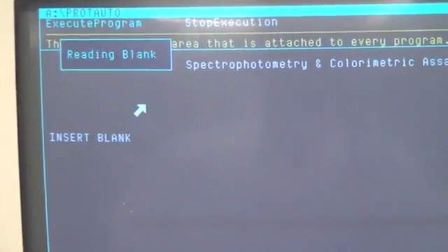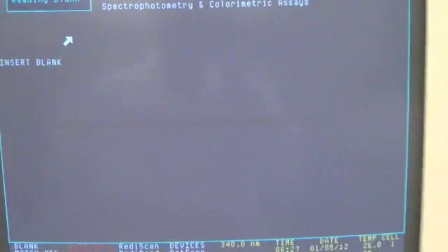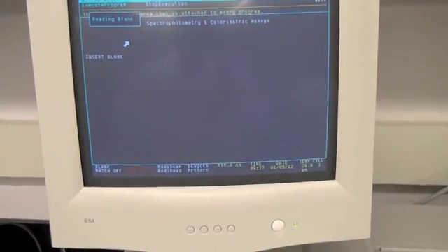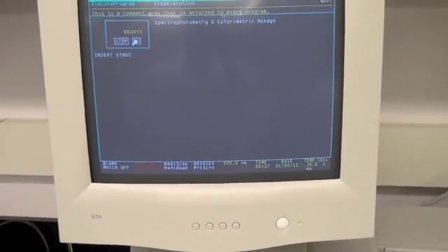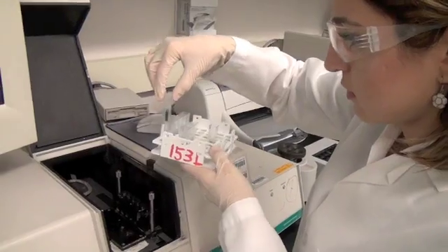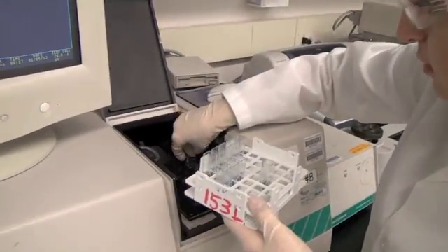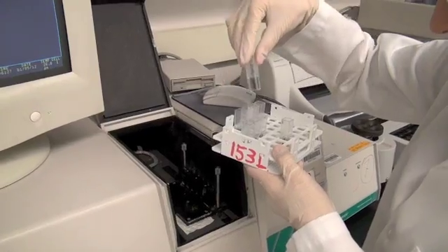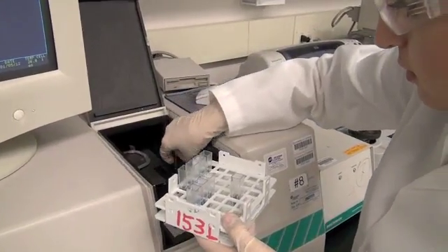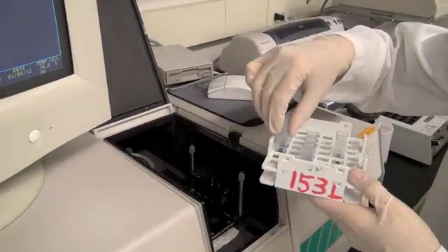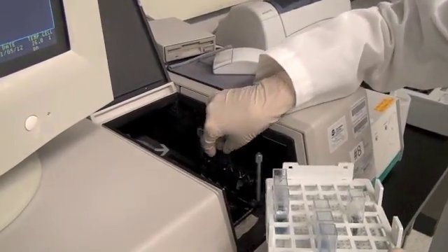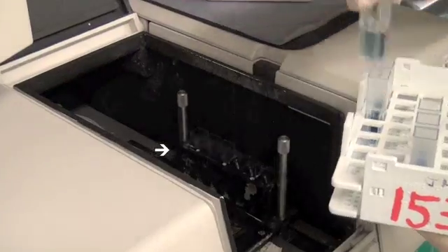After you have read the blank, the program will prompt you for the standards. Be sure to place the standards in the correct order. Standard 1 from table 1 of your lab manual should go into slot 1 of the cuvette chamber. Slot 1 is the furthest most slot of the cuvette chamber.